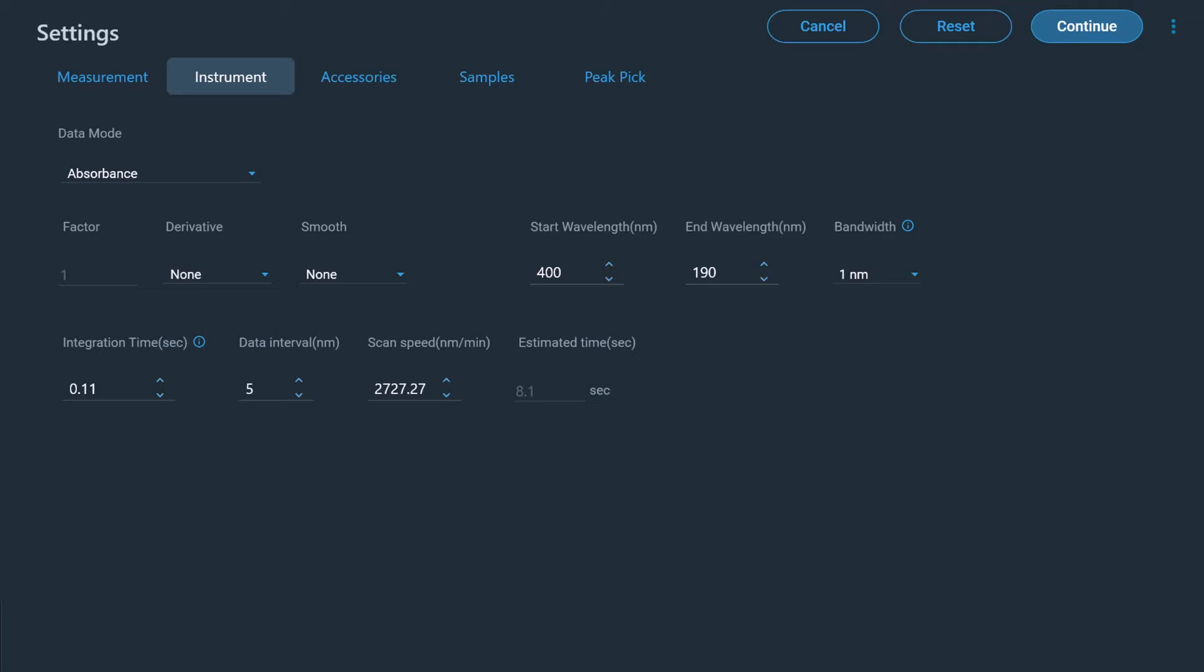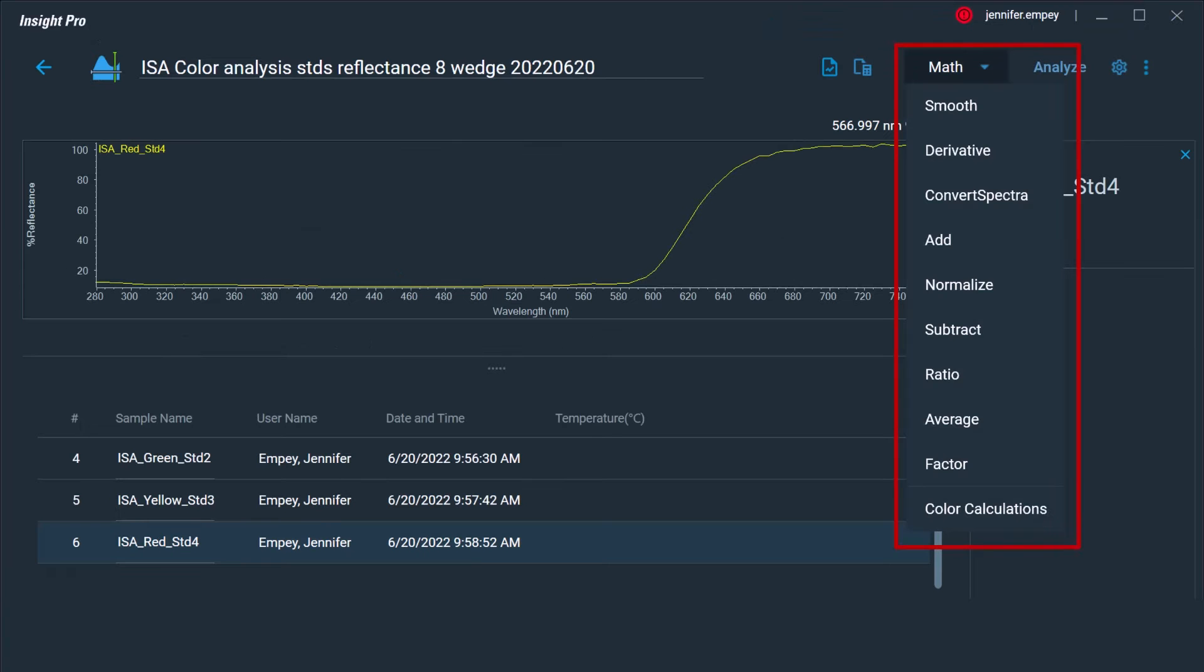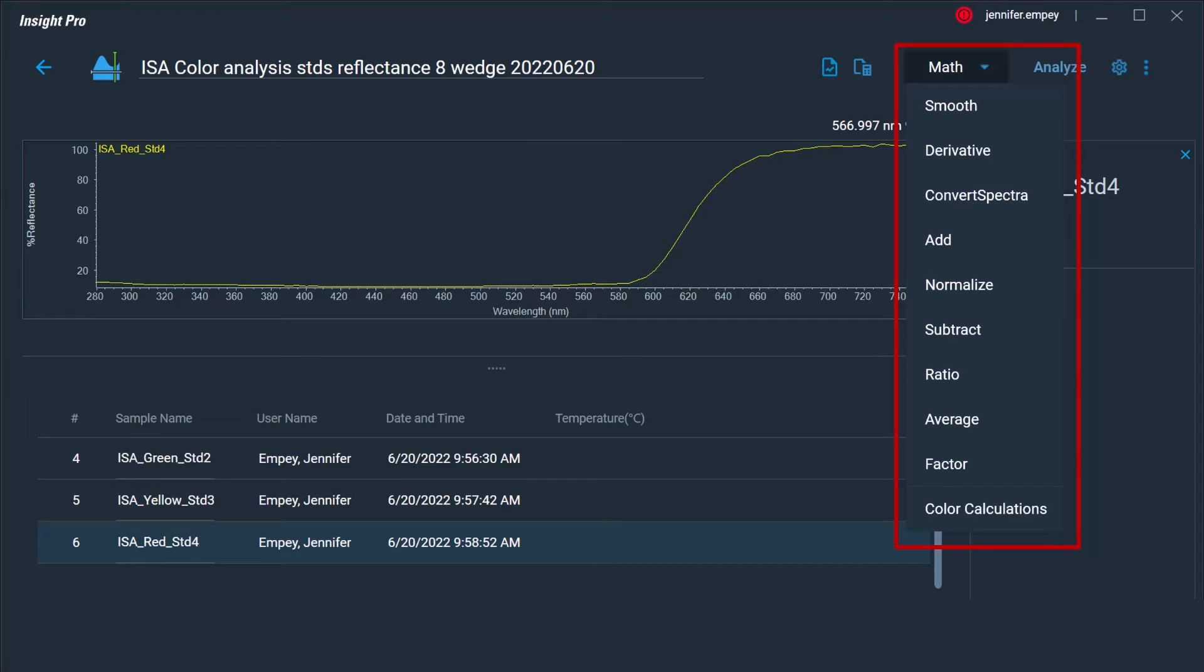A derivative of the collected data can be calculated and a smoothing function may be used as well. After the spectra are collected, there are several unique features which can be used to analyze the measured data. For example, the Math functionality includes a list of mathematical functions which can be applied both to a single spectrum, such as taking a derivative or normalizing the spectrum, as well as between multiple spectra, including adding or subtracting spectra from one another.